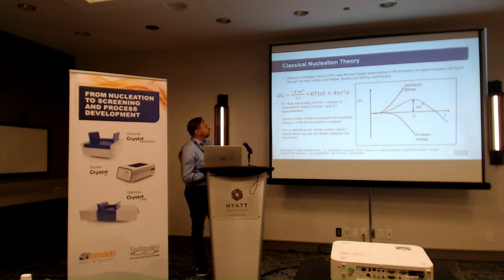Classical nucleation theory was originally derived based on observations about vapor droplets forming, liquid within vapor, by the scientists listed here. And it can be expressed by the Gibbs free energy of the entire system. Essentially what you have is an interplay of two different energy forces. First, you have the interfacial energy. This is the energy required to generate new surfaces, and actually this is the negative driver, the inhibitor, for nucleation. And then you have your second, which is the volume energy. This is the energy released when molecules are incorporated into the radius.